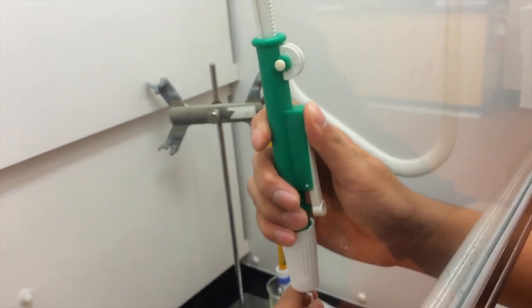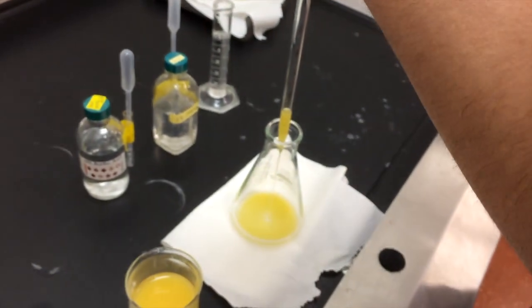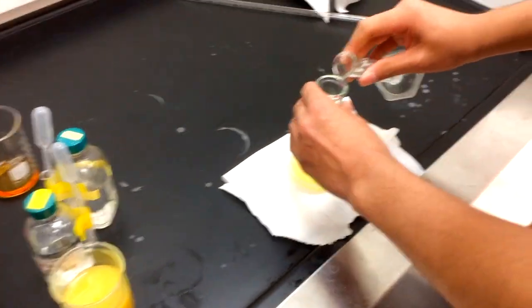Using a pipette and a pipette pump, transfer 10 milliliters of your first sample into an Erlenmeyer flask, followed by 25 milliliters of deionized water.